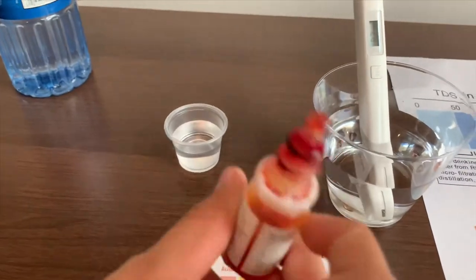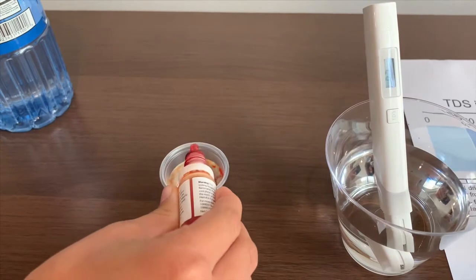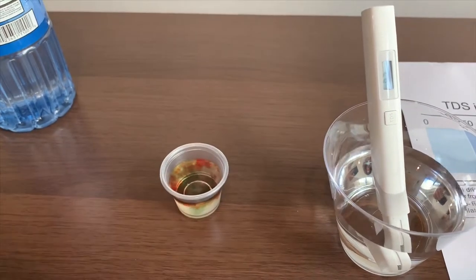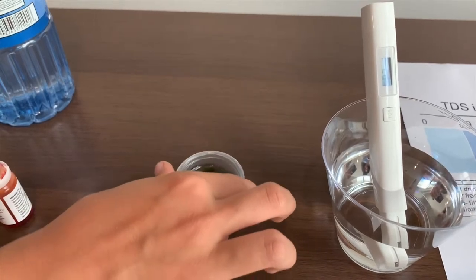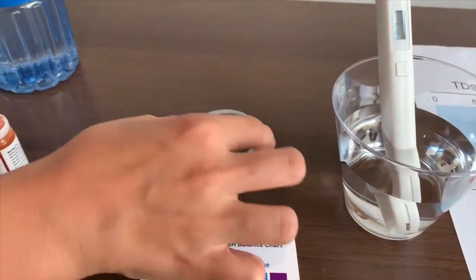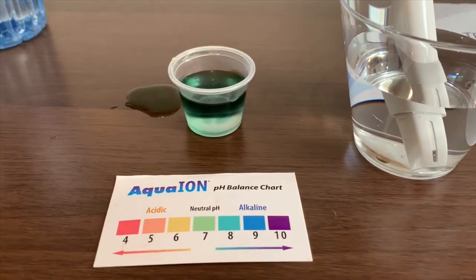Now let's test the pH level. Two drops on it. It is close to eight.